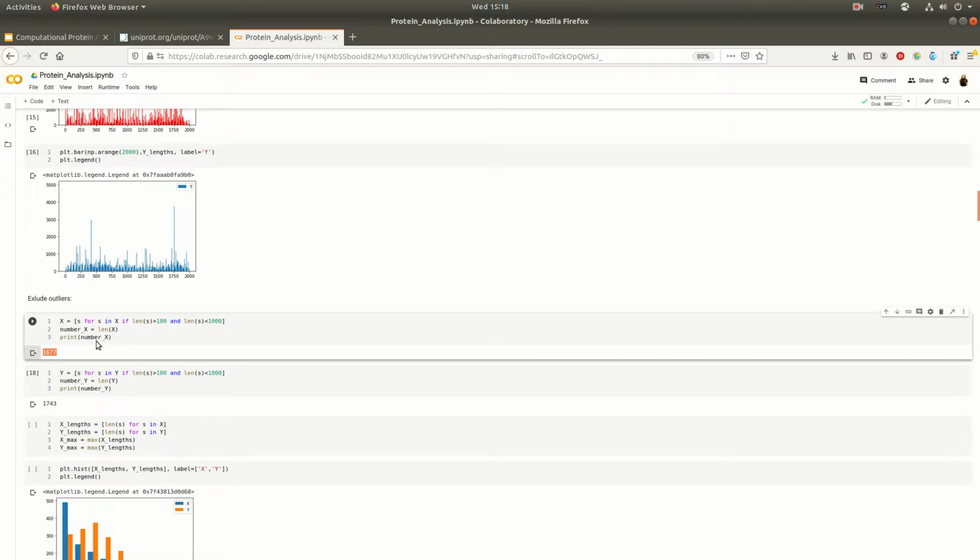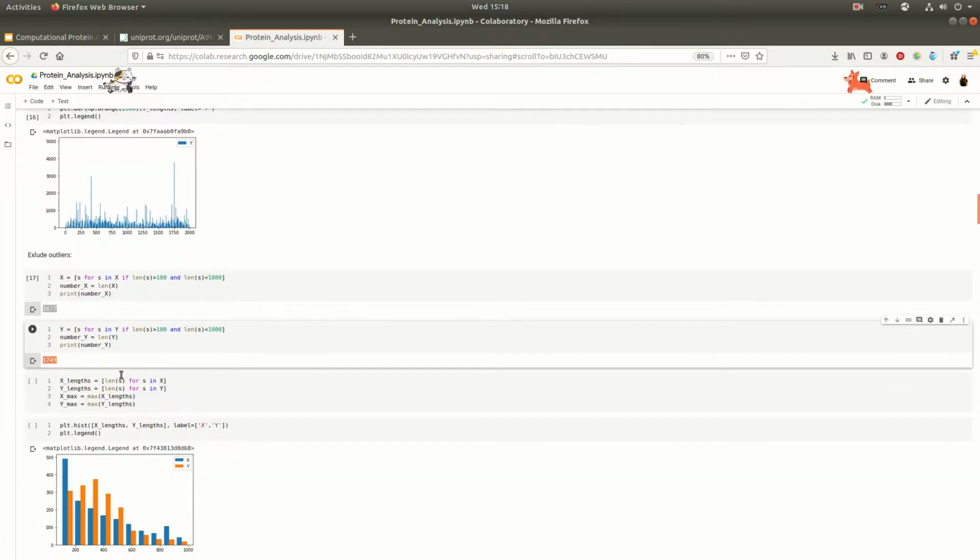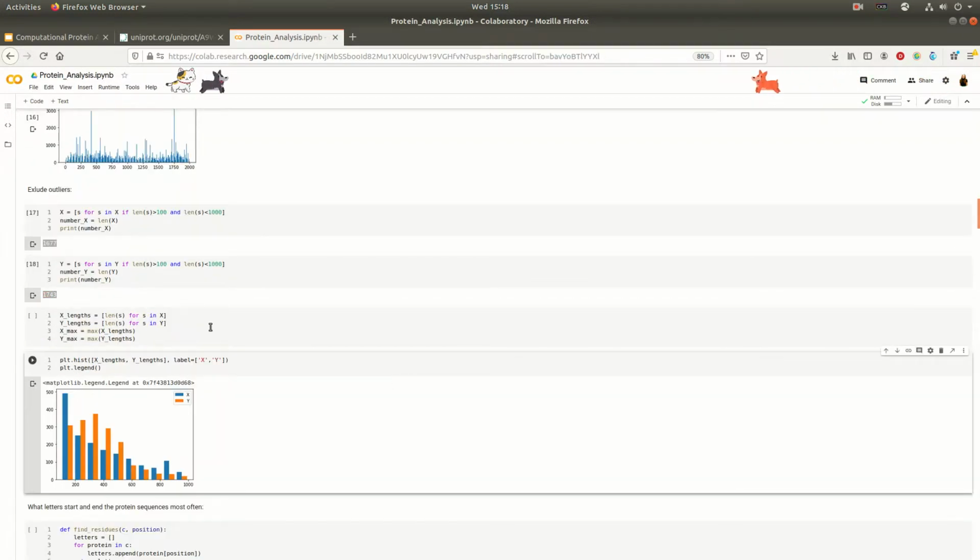Okay, so we have 1,677 and 1,743. That's pretty balanced. There's no need to have to balance that. It's almost the same amount. So that's fine. We can just keep moving right along.